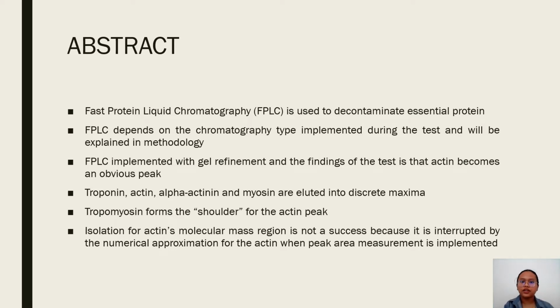The theoretical operational principles for FPLC alongside its labeled diagrams are elucidated in the subsequent explanation. FPLC is influenced by chromatography type implementations during the testing, as the techniques for the process are elucidated in the methodology section.